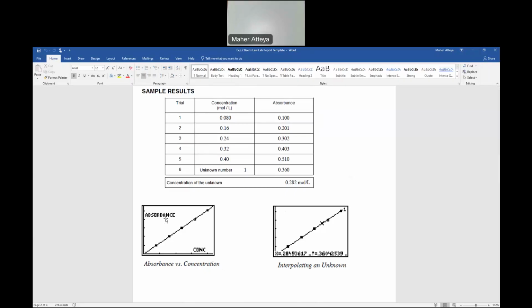If the software gives you the curve, tell me, and I will get you the snipping tool. You can snip it and email it to yourself. You don't have to do Excel. If not, then you can do Excel with absorbance on your Y-axis and concentration on your X-axis. Those are 5, correct? And don't forget the 0, 0. So there is a 6th point, which is 0, 0.